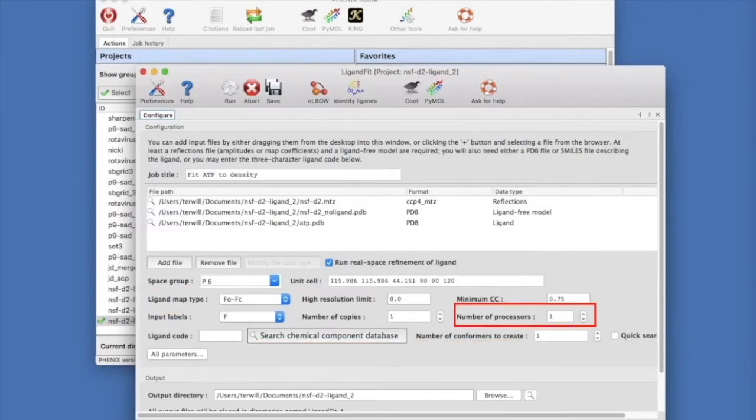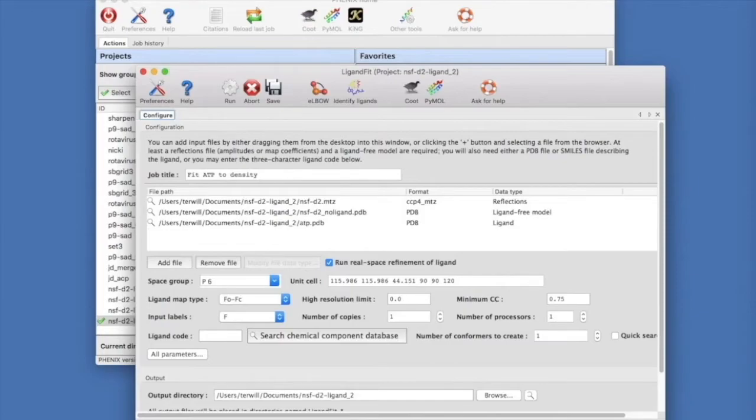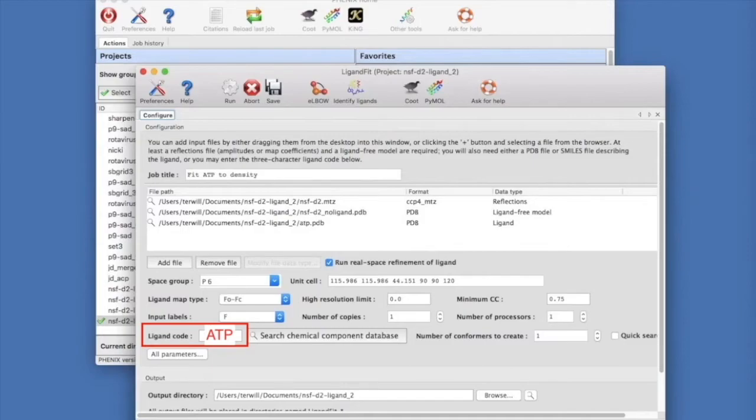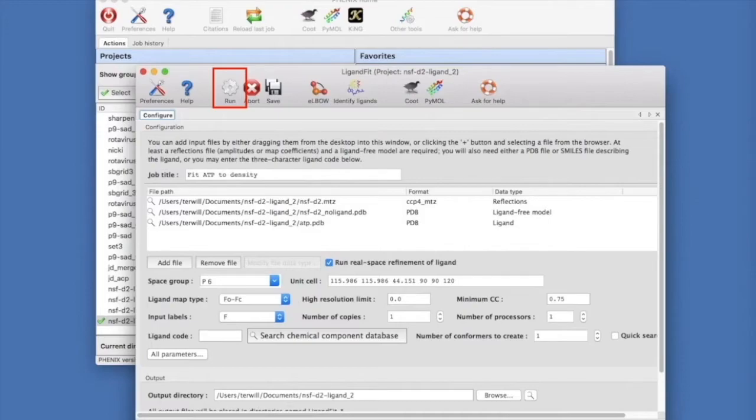Set the number of processors to the number you have on your computer. We entered our ATP ligand as a PDB file, but you could specify ATP as the ligand code and that would work as well. Now let's run by clicking Run and Run Now.